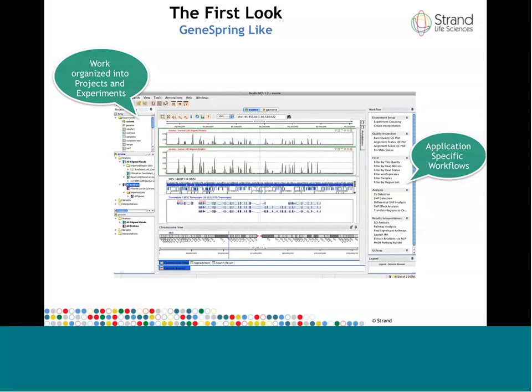The workflow comprises all the steps, starting with setting up the experiment, then doing quality inspection on the reads, filtering out bad reads, doing analysis, SV (structural variant) and SNP analysis, and then doing downstream steps relating the variants that you found to genes and their functional impact, so GO analysis and pathway analysis.